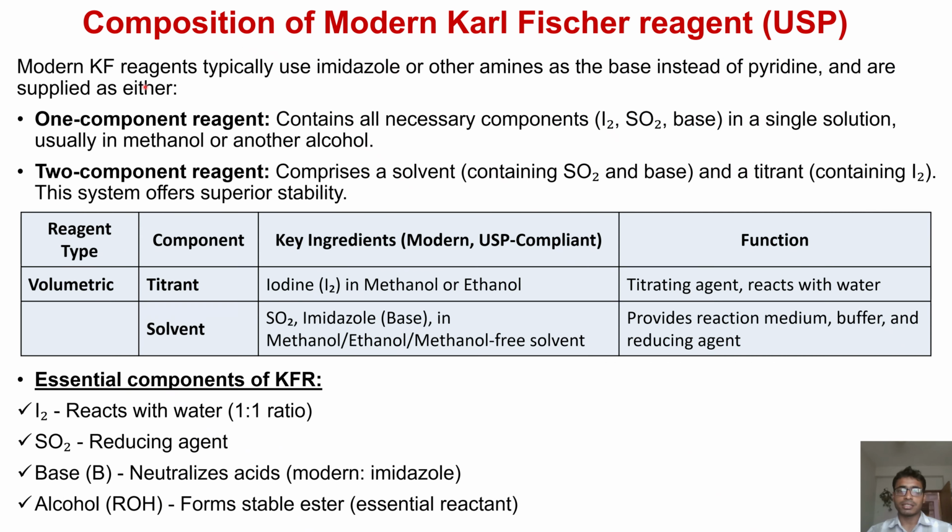Modern Karl Fischer reagents use imidazole or other amines as the base instead of pyridine and are supplied as either a one component reagent, which contains all necessary components in a single solution, usually in methanol or another alcohol, or a two component reagent comprising a solvent and a titrant. This system offers superior stability.